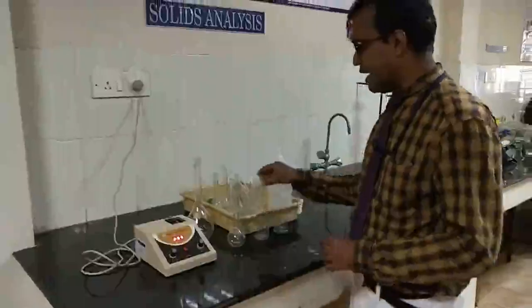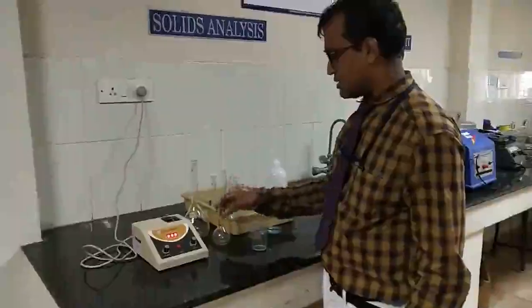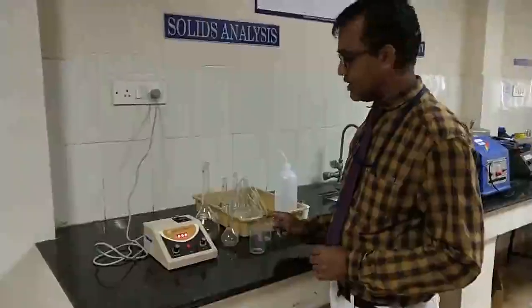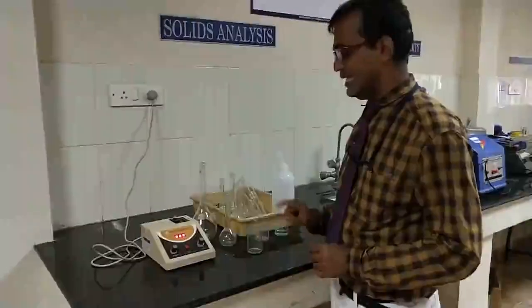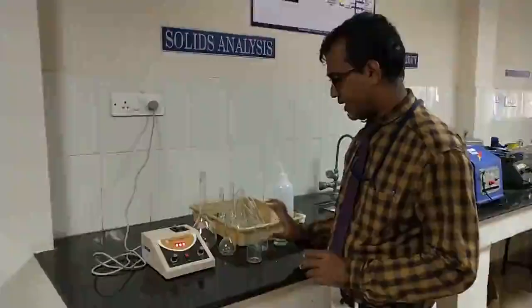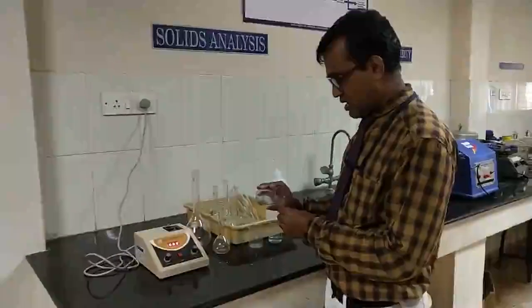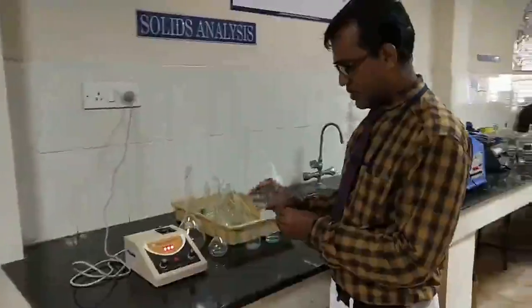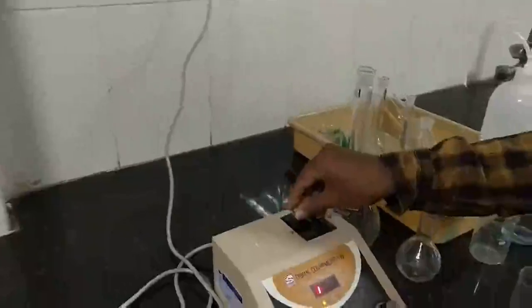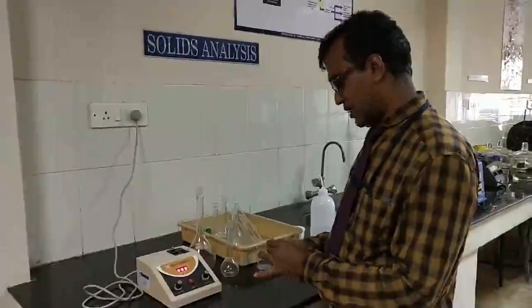Then take the prepared 100 and 200 concentrated solutions, and take 5 ml of the required concentrated solution, add 5 ml of 3% TEA solution, and then add 10 ml of water, and make it ready. Then take a cuvette, pour that solution, and keep it in the digital colorimeter. Preparing the required amount of concentrated solutions.